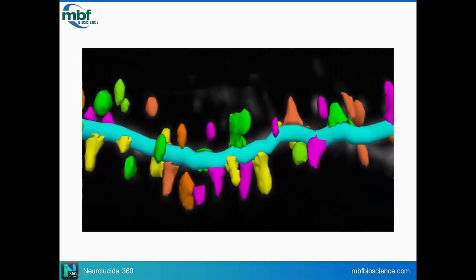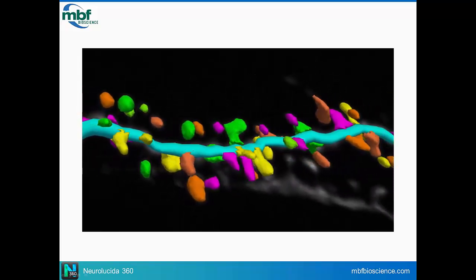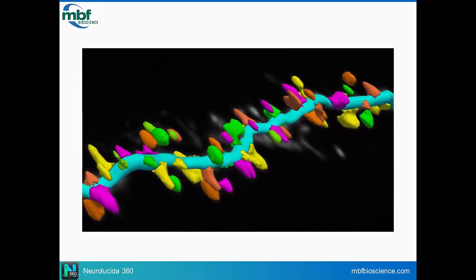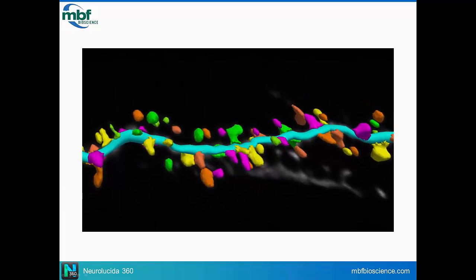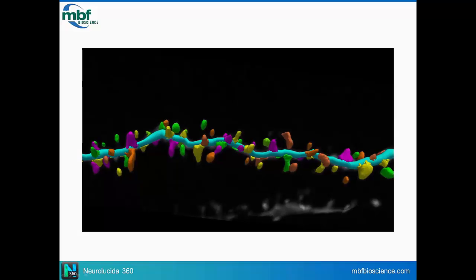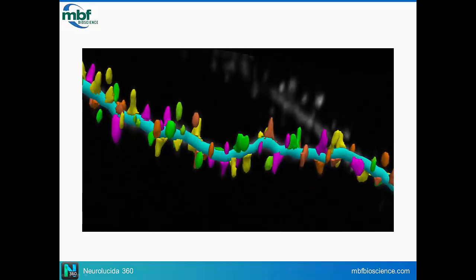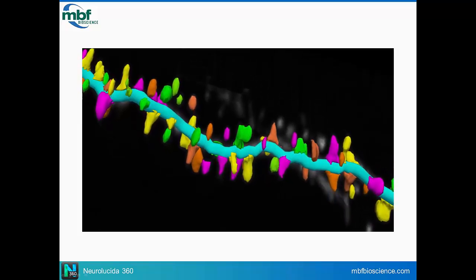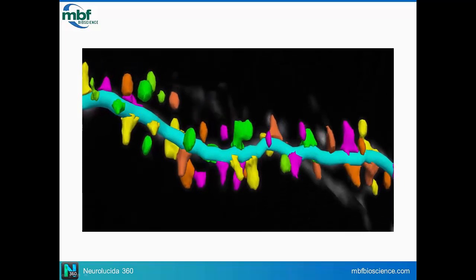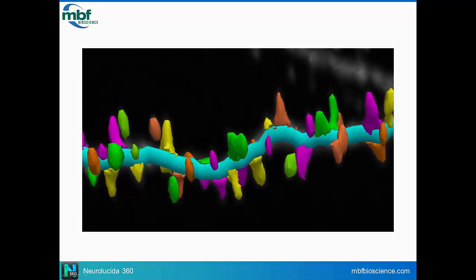Okay, let's end up with this one, Dara, if you don't mind. Can you answer Adam's question? He wants to know if there's an advantage to perfusing the animal with PBS in order to flush out the blood in the brain before staining the tissue. He's using Golgi. A recent study identified that fixatives normally used in perfusion caused glial cells to be stained rather than neurons. But if only a PBS solution is used, the neurons were stained clearly without glial cells.